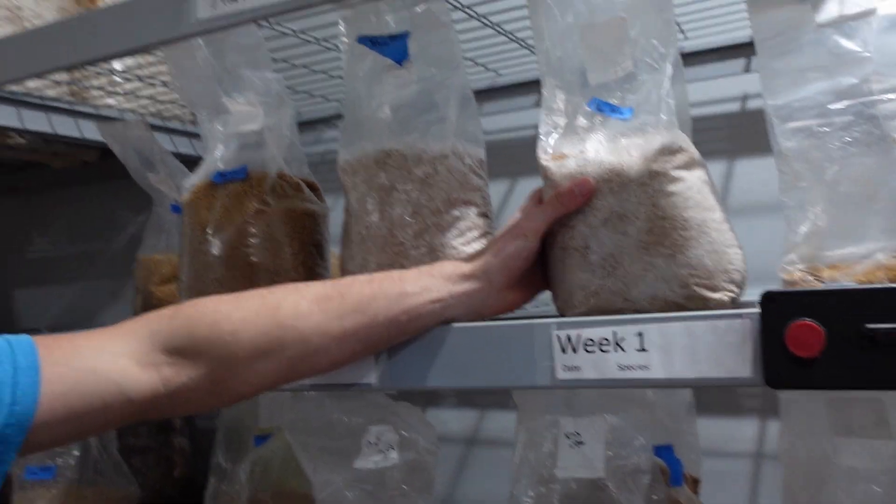It's already in the bags. Lots of inoculation points from the individual grains that we broke up and poured into them, and we'll get a really quick, speedy colonization on our bags. But again, we want to have the most sterile procedure as possible.